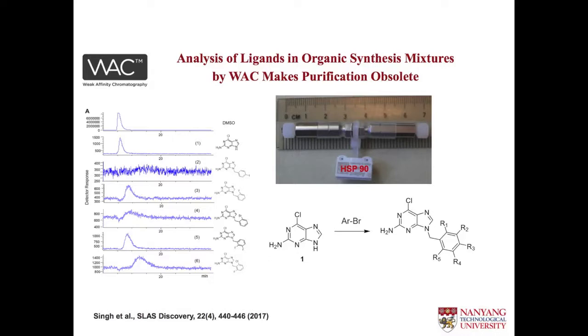So here you can see the number of products, where they are and what affinities they have. They were substituted at this position here, a number of different ones, and all can be characterized in one shot, the affinities of them. And here is the starting point, we still see that. We can actually discover degradation products, side reactions, and everything.